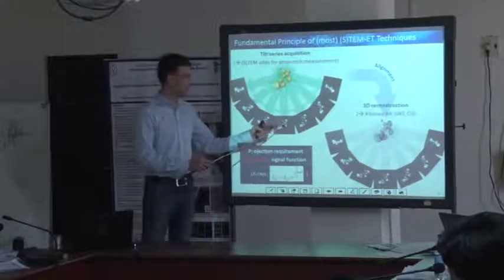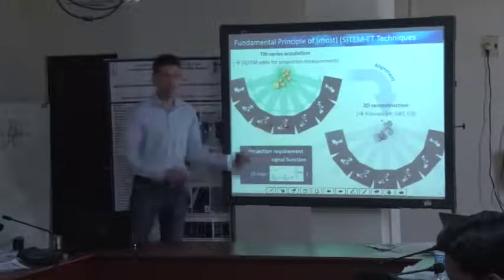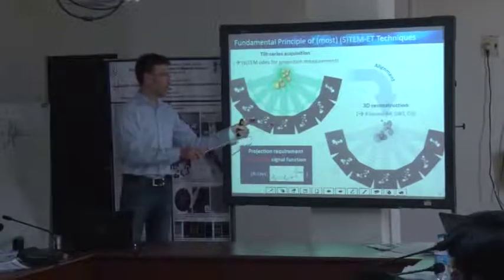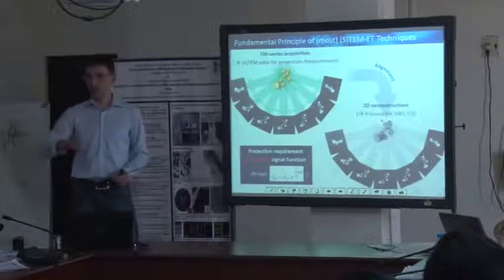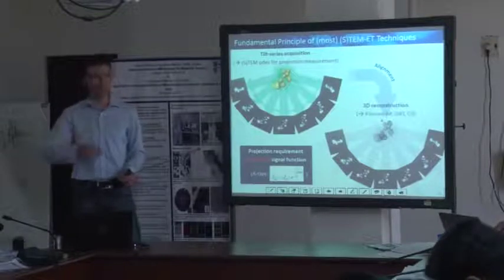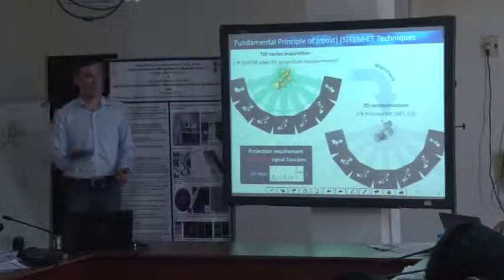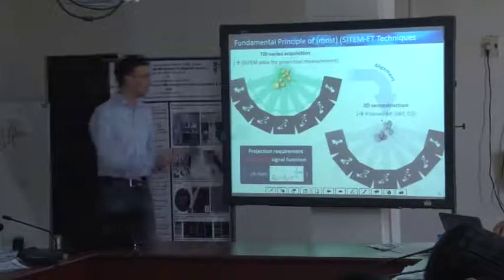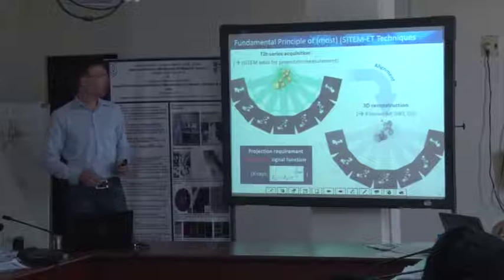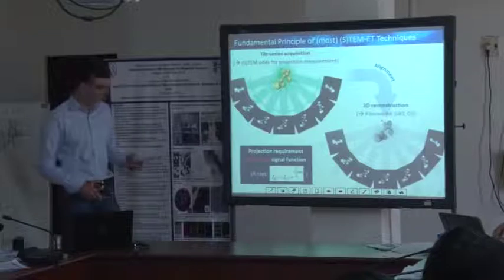So meaning that either the thicker the sample is, the higher the intensity that you measure, or the heavier the material is, the higher the intensity. If you end up with this weird Bragg diffraction, and you might get in and out of zone axis, your intensity will fluctuate, and there is no reason for that except Bragg diffraction. But it has nothing to do with the local thickness or the local density of the material. And this is why these conventional TEM imaging modes are rarely applied to conduct such electron tomography.